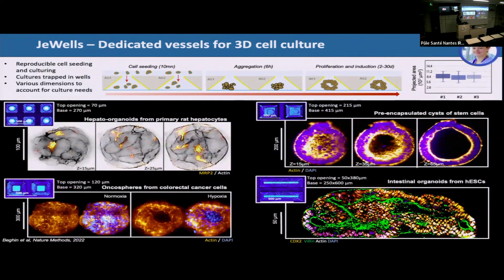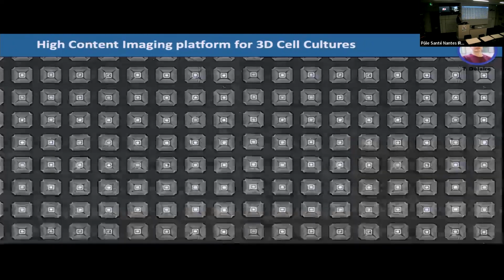You can have a square, which is the most useful, but you also have an elongated one, which allows you to grow this organoid and to image them from the beginning up to a very long period of time, and they can really grow for weeks in there, and then you can image them. So the imaging was the work of Tom, a team member who just defended his PhD a couple of weeks ago. So the idea is now that we have this system, which is very simple in terms of image analysis.